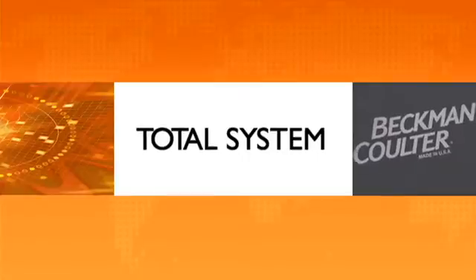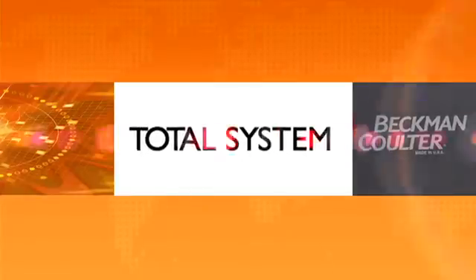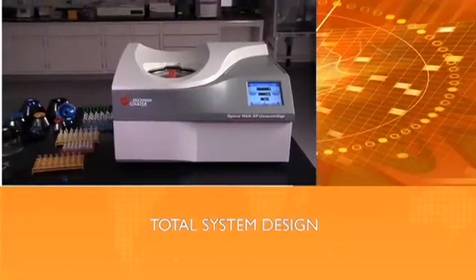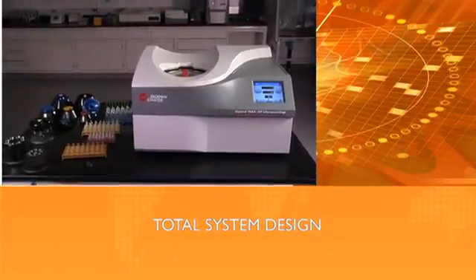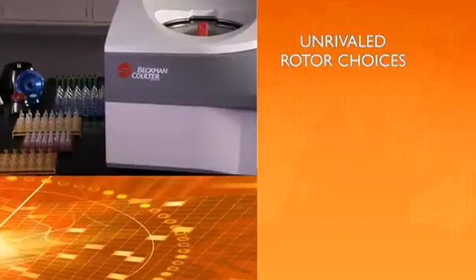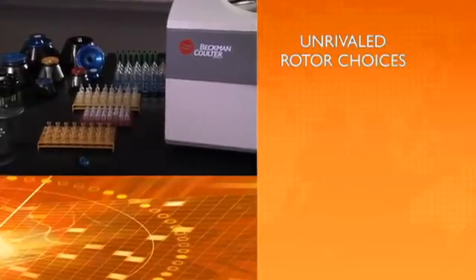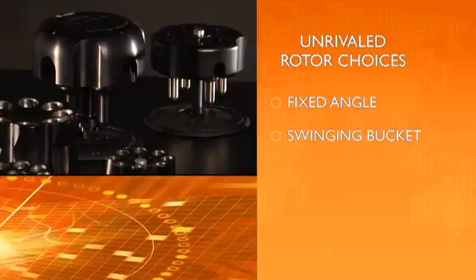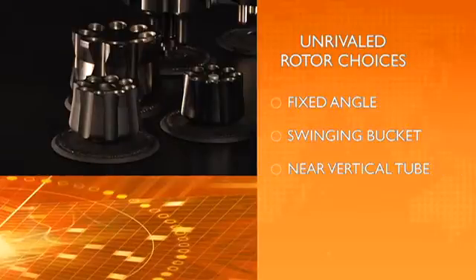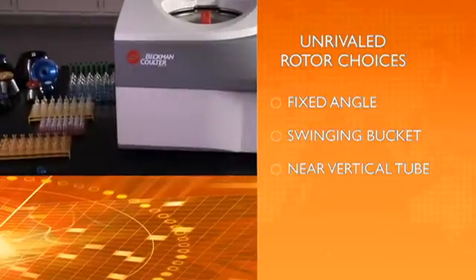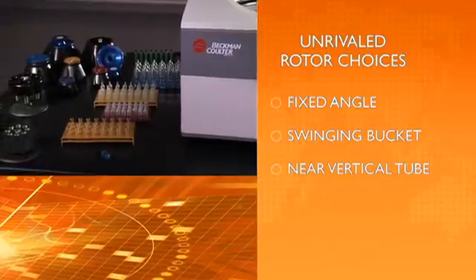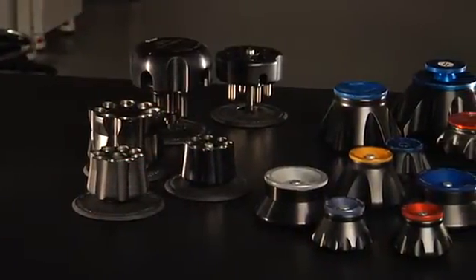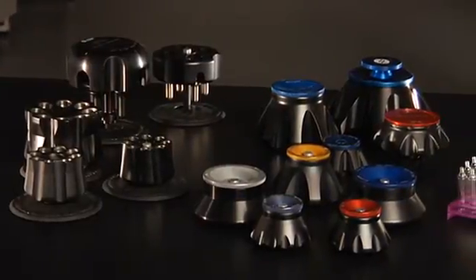The Optima Maxx series instruments, rotors and labware are designed, manufactured and tested as a total integrated system to ensure optimal performance and safety. The Optima MaxxP is fully compatible with our complete Beckman-Coulter library of fixed-angle, swinging-bucket and near-vertical-tube tabletop ultracentrifuge rotors, allowing you to fine-tune your research and deliver fast, accurate results. And the Optima Maxx TL is compatible with our line of TL series rotors.